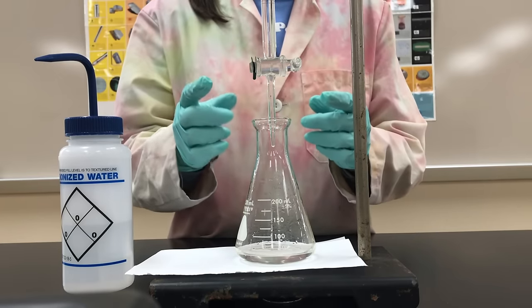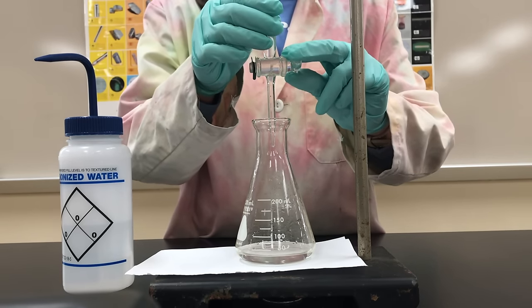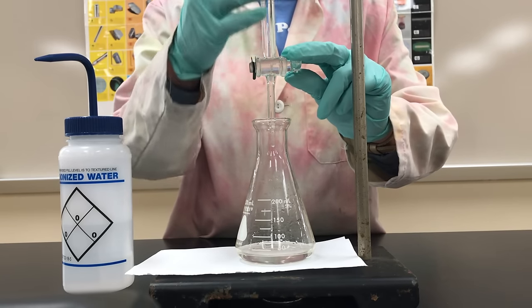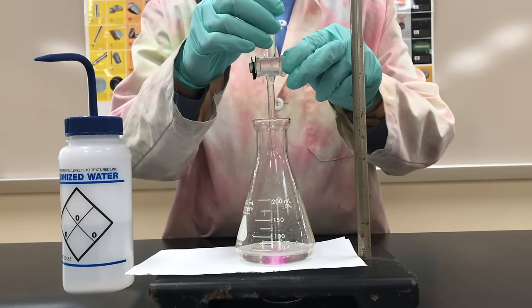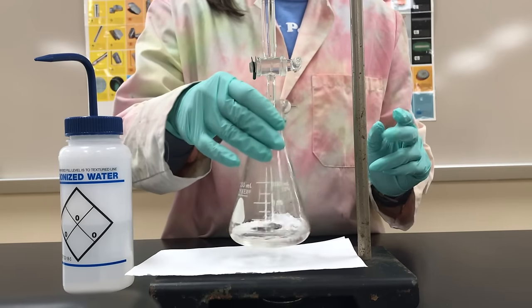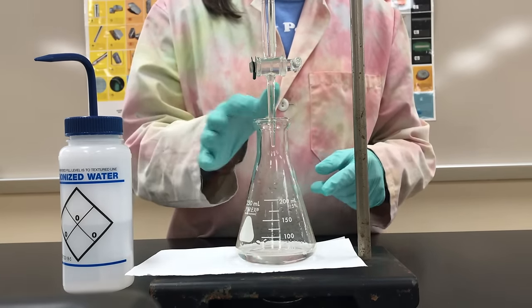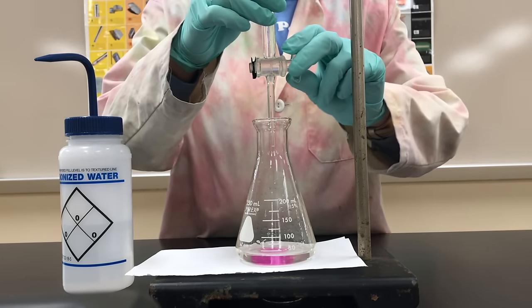When you first start your titration, hold the burette with one hand and put your other hand on the stopcock. You'll turn it to the parallel position, and the solution that is the standard, the titrant, is going to be coming out through the tip. Add a little bit and stop, because you don't know where the end point is. You'll see a flash of pink color, and then when you stir it, that'll go away. Try to avoid hitting the tip of the burette. Add a little bit more.